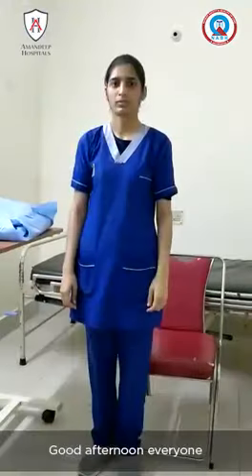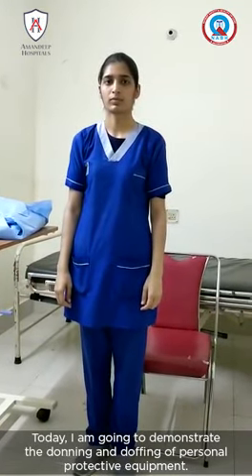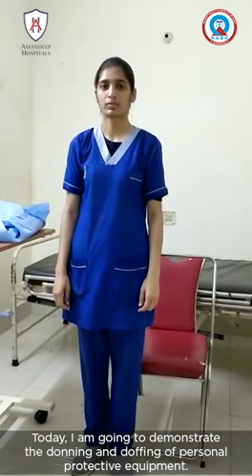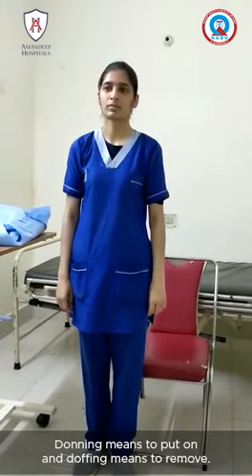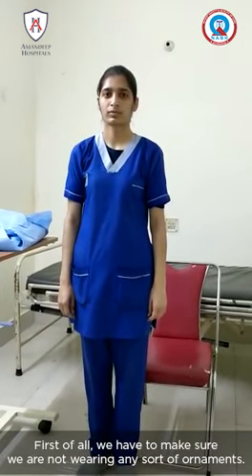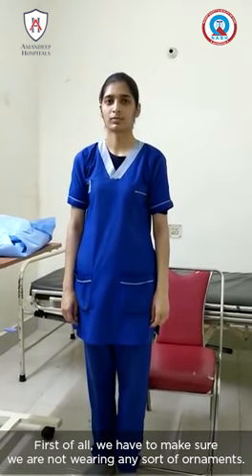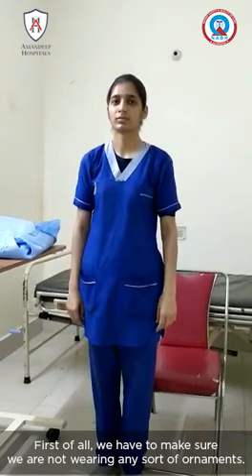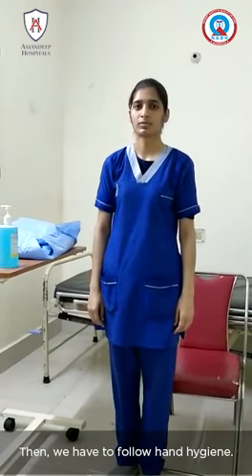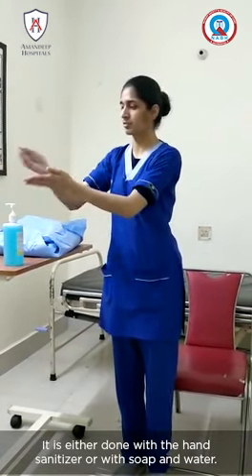Good afternoon everyone. Today I'm going to demonstrate donning and doffing of personal protective equipment. Donning means to put on and doffing means to remove. First of all, we have to make sure that we are not wearing any sort of ornaments. Then we have to follow hand hygiene, either with the hand rub or with soap and water.